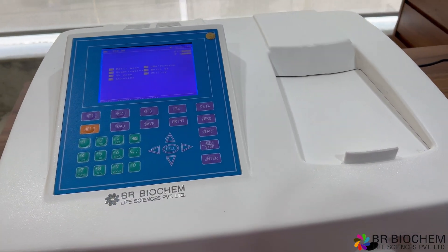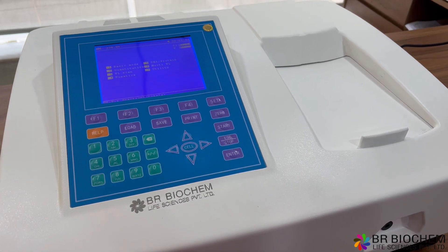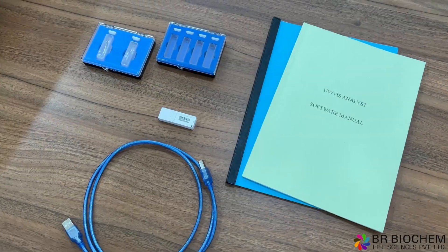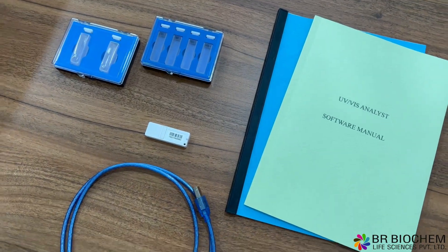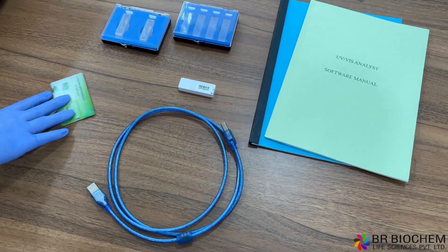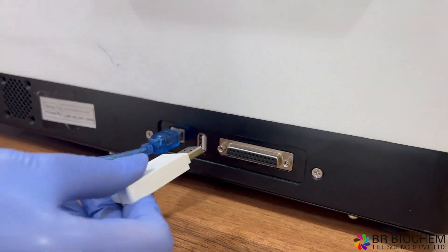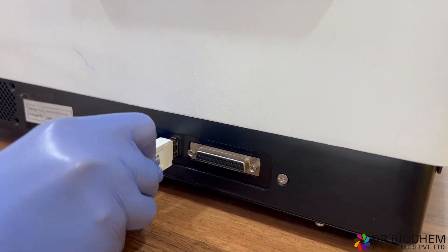Now, let's take a look at the standard configuration of our Double Beam UV-Vis Spectrophotometer. Each purchase includes four glass cells and two quartz cells. You will also receive an instrument cover, a software CD, a USB cable, an operational manual, a software manual, and a software key.